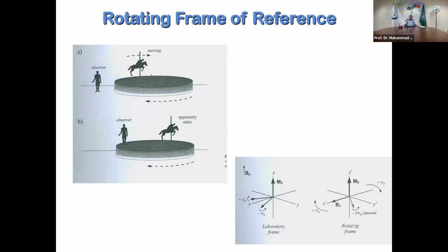And this is desirable because in all modern NMR experiments, which are multi-pulse, multinuclear NMR experiments, you need to understand which peak is where on this three-dimensional Cartesian system, on this transverse plane. If you do not really develop this concept of rotating frame of reference, you would never be able to understand that if you have three protons, which one is where and what is the location of it.